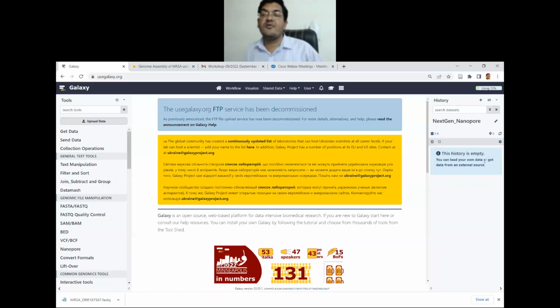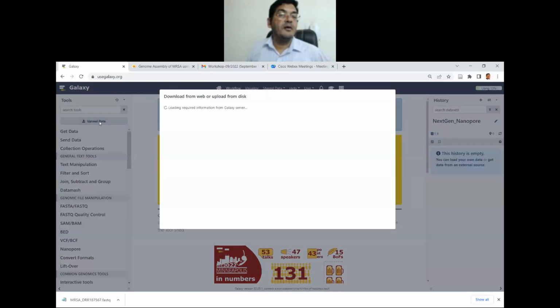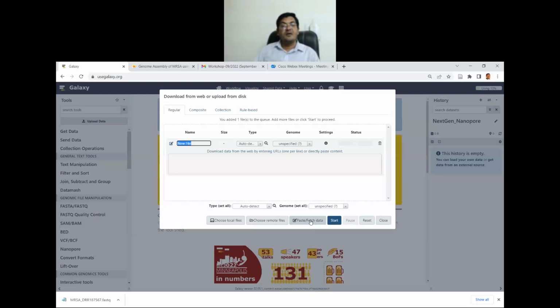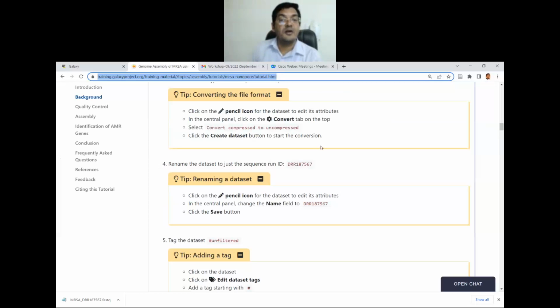So here there is nothing as of now. Now I come to upload data here. Everybody, please follow, because I want you to upload the data now. Open the tab for the tutorial that I've given you and go to upload data. So you click here. This is where you can add your data, and we're going to use a URL to add data. So we say paste and fetch. This is where you can add your URL for the data. We'll go back and fetch the URL for the data.